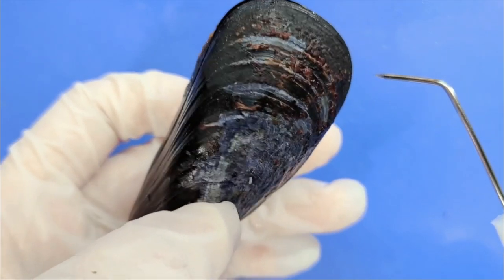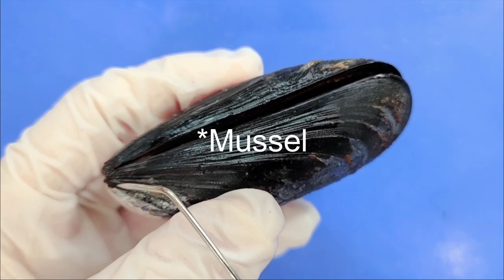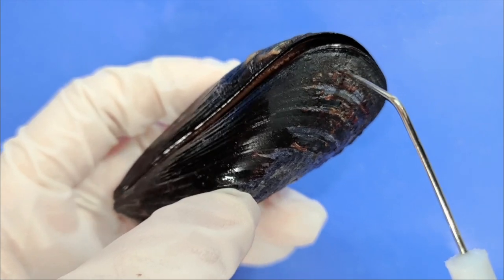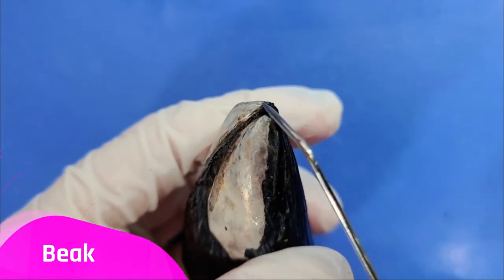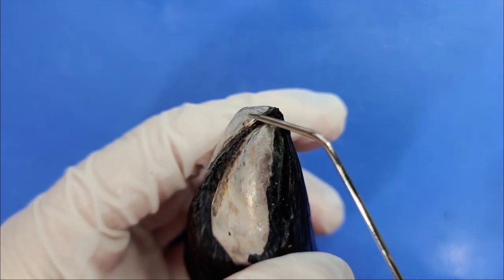The part closer to the hinge would be the older part of the mussel, and the new rings here would be the newer part. This pointed end is called the beak, and this is the oldest part of the mussel — this hump-like structure near where the two shells are hinged together.